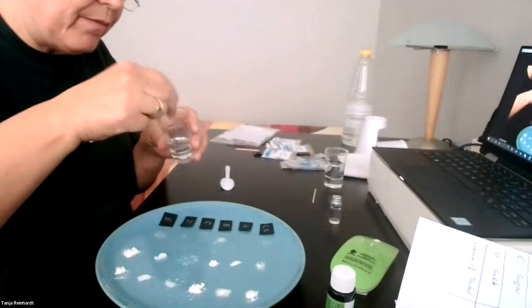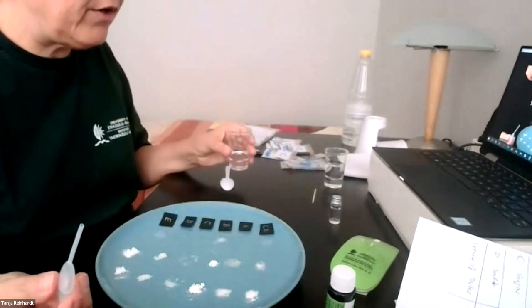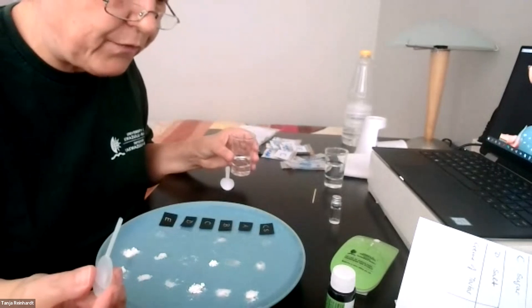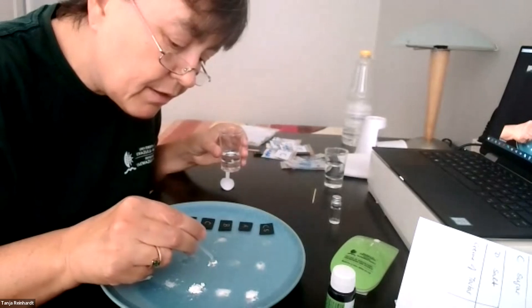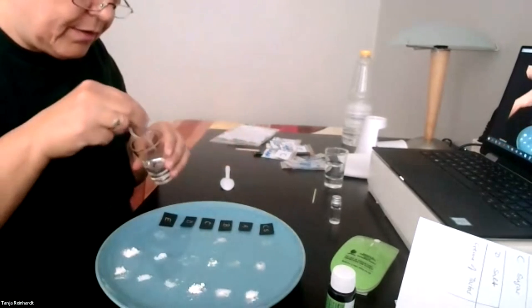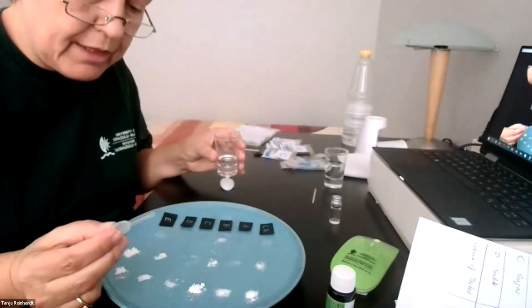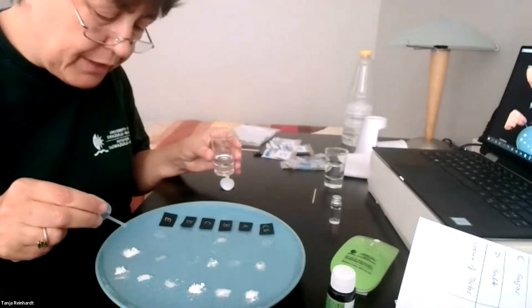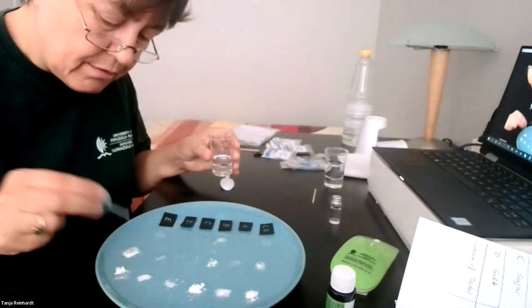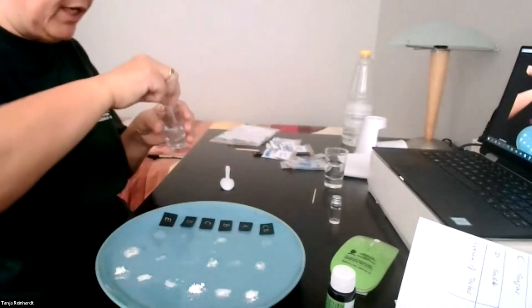So let's see with suspect A. Oh, I don't know if you can hear this, but it's definitely fizzing. Number B. Nope, nothing. Number C. Whoops, nothing. Number D. Also nothing. And E. Also nothing. Apart from that, it's getting really murky.